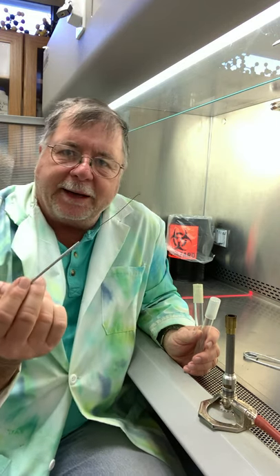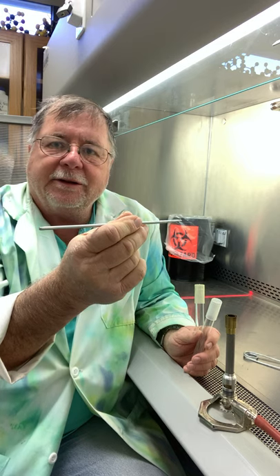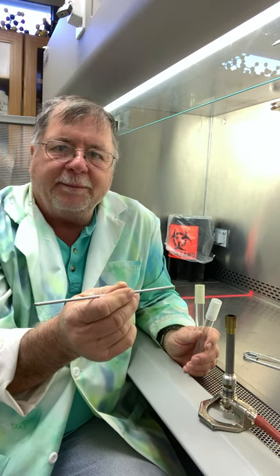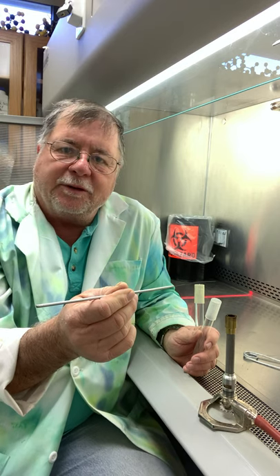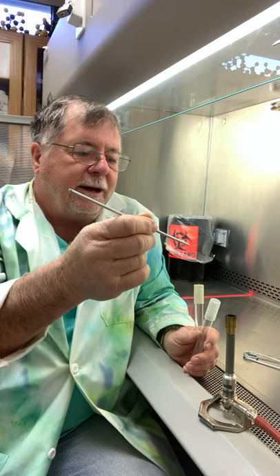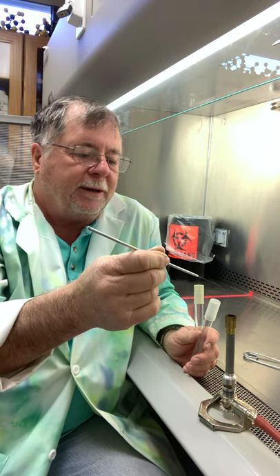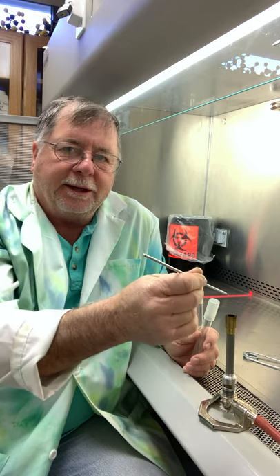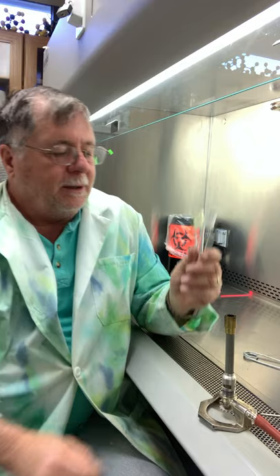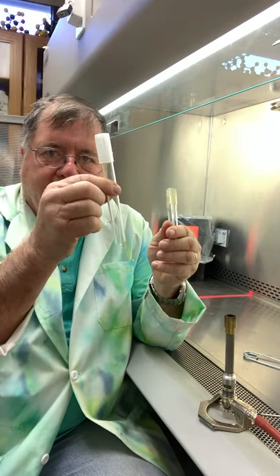Because we have bacteria on here now, we want to start high and give it a chance to burn away. If you just put it in the hottest part of the flame, there's some liquid in there and it will splatter. Okay, so you don't want that. So you want to start high, and then when it starts to burn off, you can get lower into the hottest part of the flame, and then sequentially get it red hot all the way. And then you can set this down.